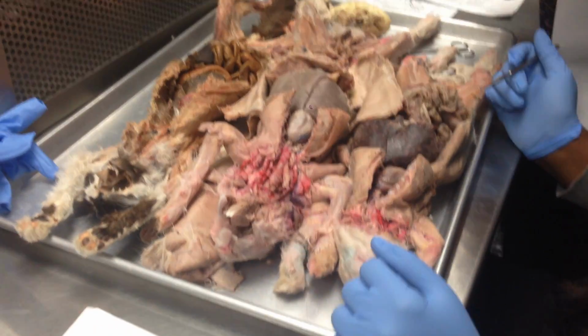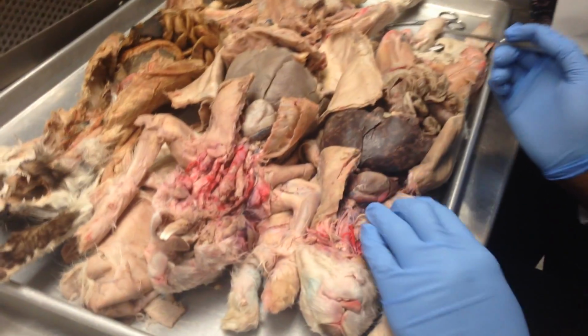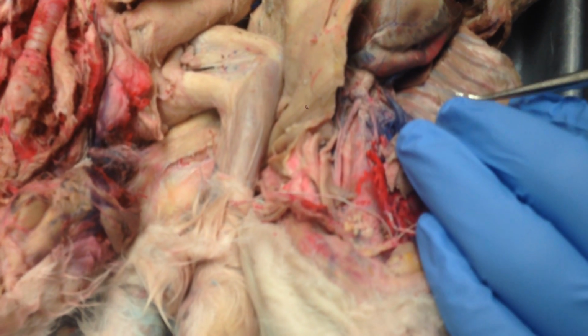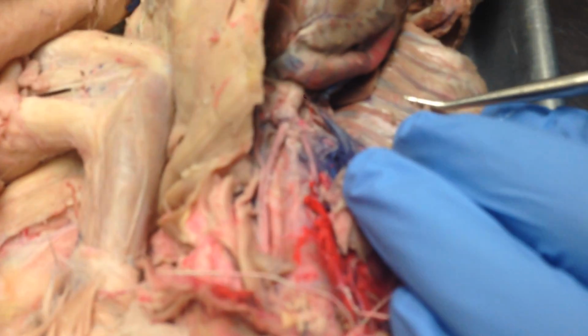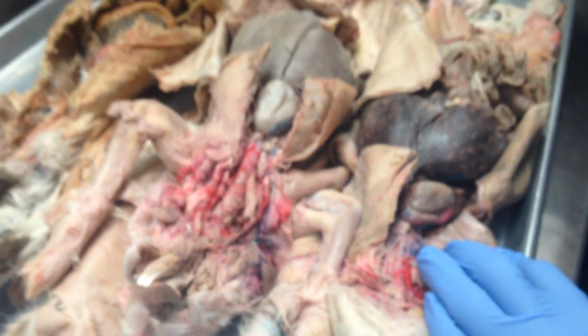Okay, so we're starting with the digestive system, and the first thing we're going to go over is the parietal pleura. The parietal pleura you can usually lift off where the ribs are. It's a thin, white layer that looks like fascia.